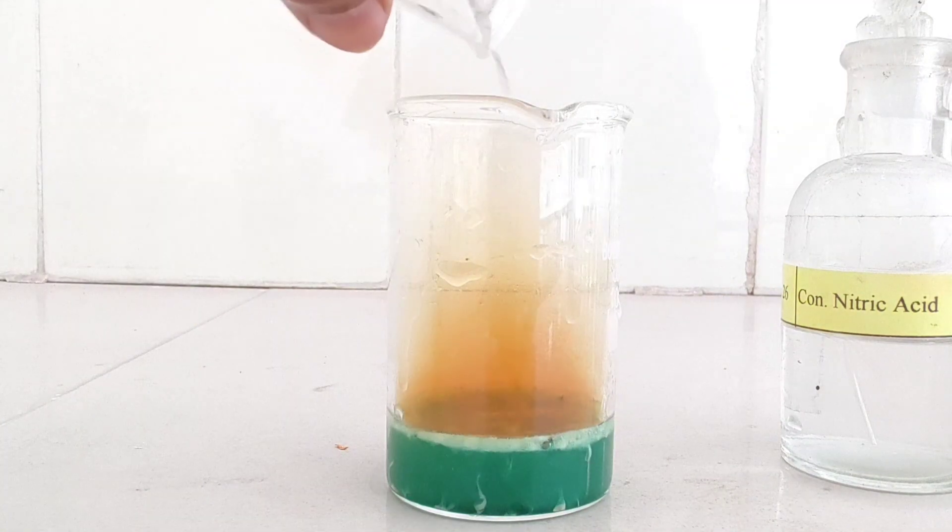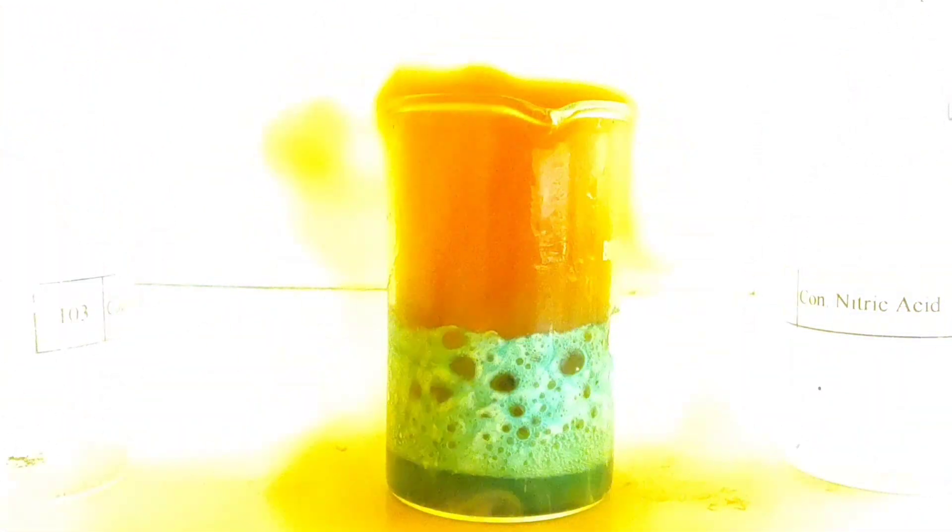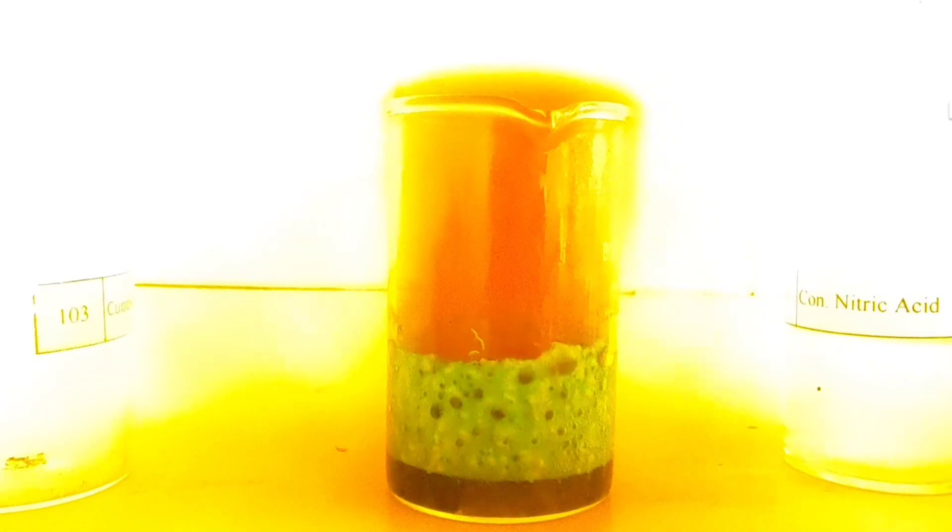When the copper is first oxidized, the solution is very concentrated, and the Cu2+ product is initially coordinated to nitrate ions from the nitric acid, giving the solution first a green, and then a greenish-brownish color.